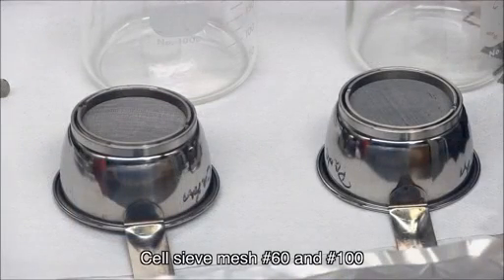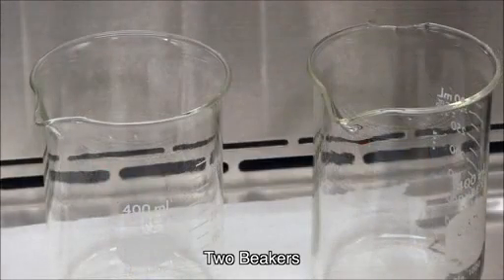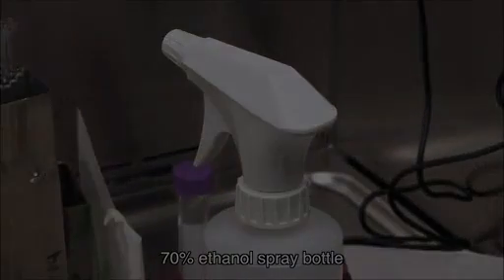Cell sieve mesh number 60 and number 100. 2 beakers. 70% ethanol spray.